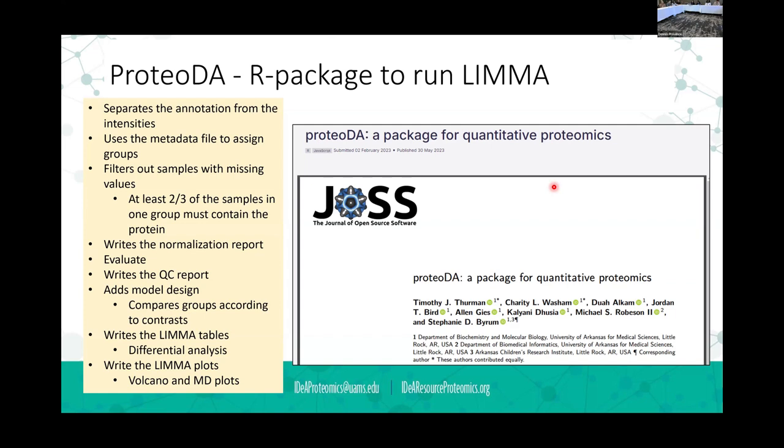And then we get to go and evaluate, look at it, set eyes on it. We do this for every project and decide which one of these normalization processes looks the best. Now sometimes normalization is not appropriate. For our IP experiments, we don't normalize, because that's not what we need to do there.